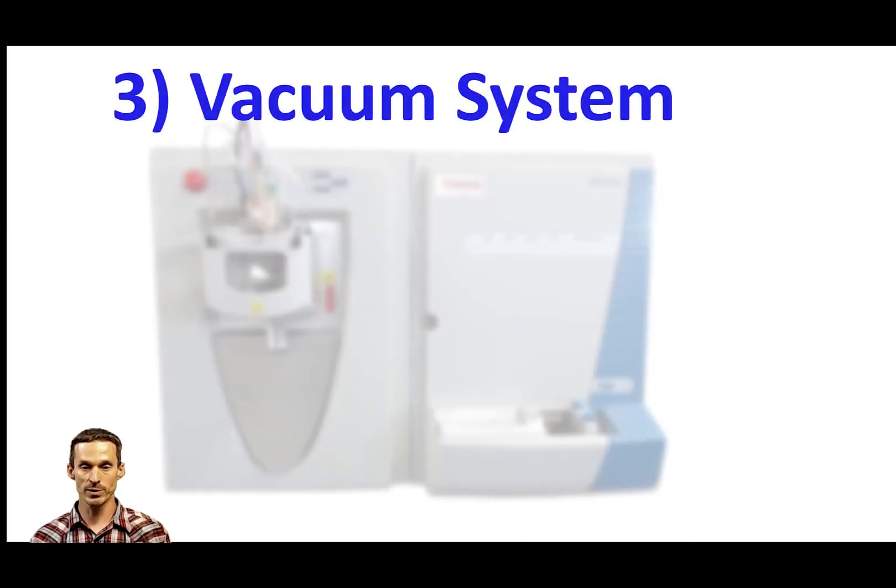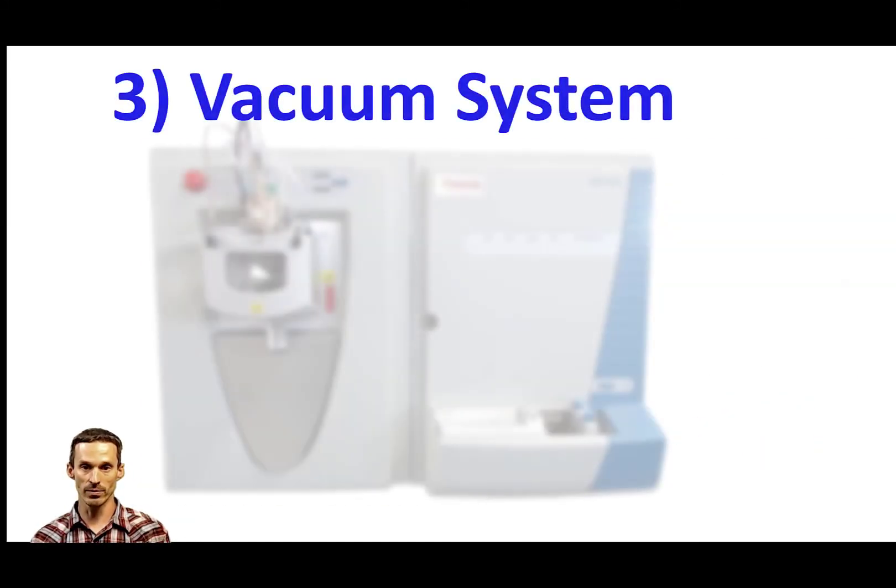And lastly, I'll just mention that mass spectrometry always takes place in a vacuum. There's many reasons for that, but basically the entire system is enclosed and we have a big pumping system that's going to suck the air out of it. We won't worry about how that works. Right now, you're looking at a turbo molecular pump, which is like a jet engine kind of system that just sucks all the air out.